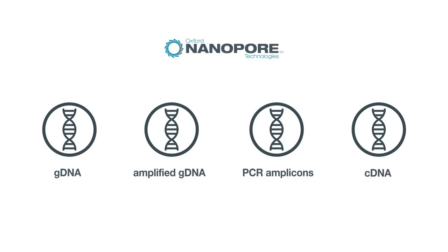Including first and second-strand cDNA synthesis into the workflow allows RNA investigations to be carried out.